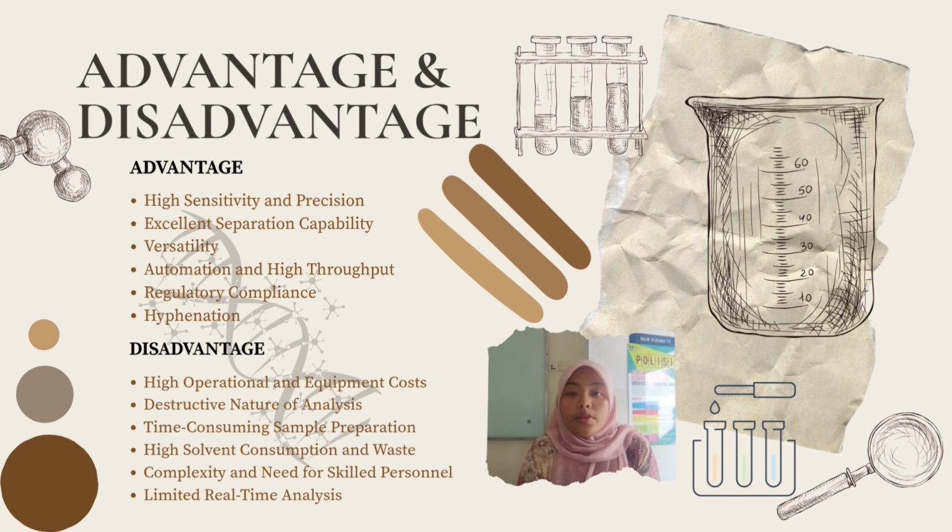And chromatography methods like HPLC and GC are universally accepted and a standard requirement by regulatory bodies for drug approval. Last but not least, chromatography also allows hyphenation, where coupling chromatography separation with mass spectrometry allows for simultaneous separation, quantification, and structure identification of unknown impurities or drug metabolites.